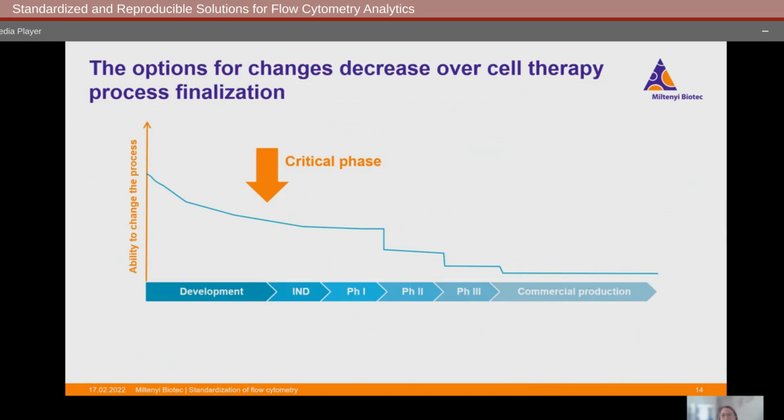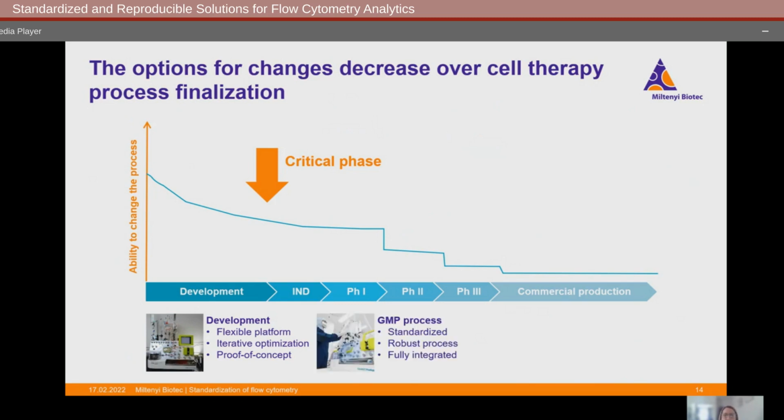Historically, new cell products have originated from academic environments, and they're developed in basic research using very well-trained scientists. Translating this into a commercial manufacturing environment can be very difficult. You need to scale up very manual, complex procedures that require basically humans to be perfect, and that's obviously a very difficult goal to meet. So what we strive for is to remove the need for human operator excellence and translate that to more standardized, robust, integrated processes with automated workflows that can increase productivity much more. The paradigm is to integrate, automate, and de-risk this process.